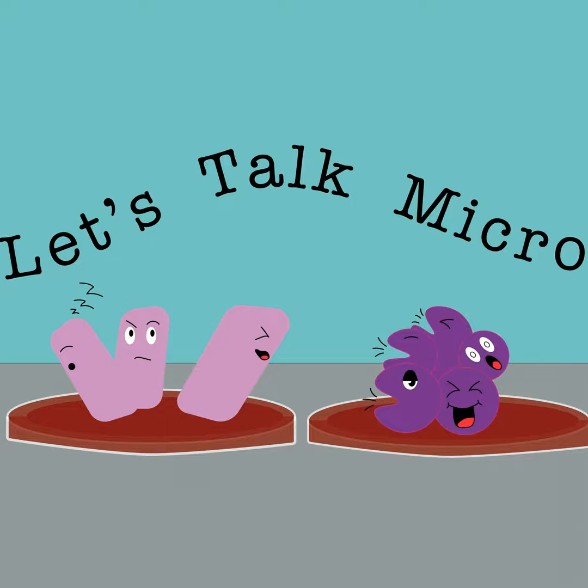And so I had to look for microscopes that were going to be affordable. We're lucky because we're a small university and the class sizes are small, and only my two sections of the class were running this way. So we didn't have to purchase a huge number of microscopes. I got a good deal on a microscope containing an oil immersion objective lens, and we twisted arms a little bit, and we were able to send them home with the microscope.